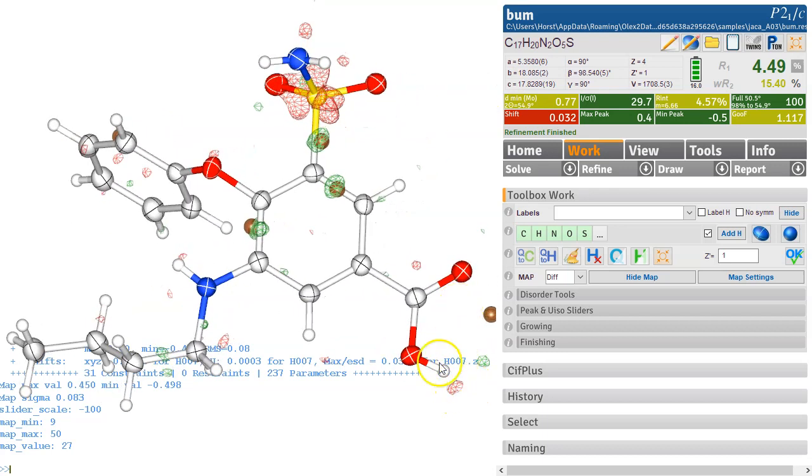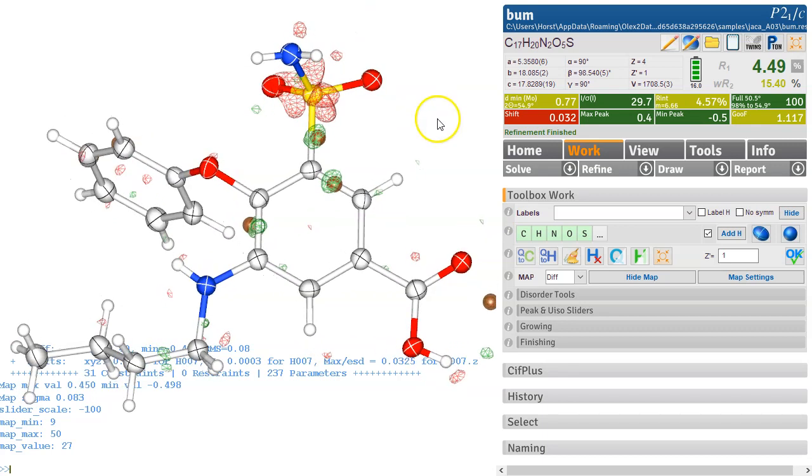So what's going on here, we've got a hydrogen on that carboxylate, but let's have a look at the distances. That's 1.23. And that one is 1.31. So that's clearly the protonated acid and not the carboxylate. So we've got no charge here, no charge here, no charge here. So nothing here is charged. So that's good.